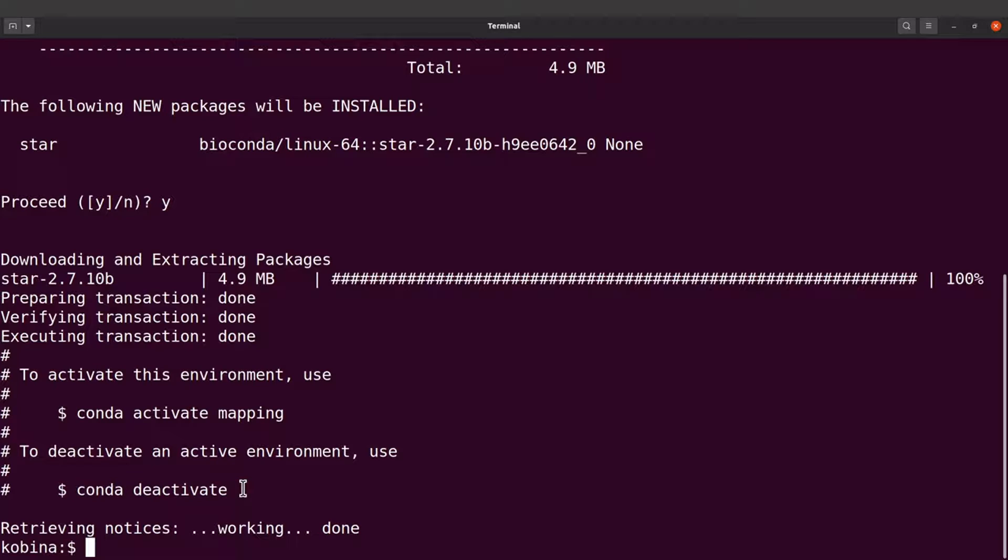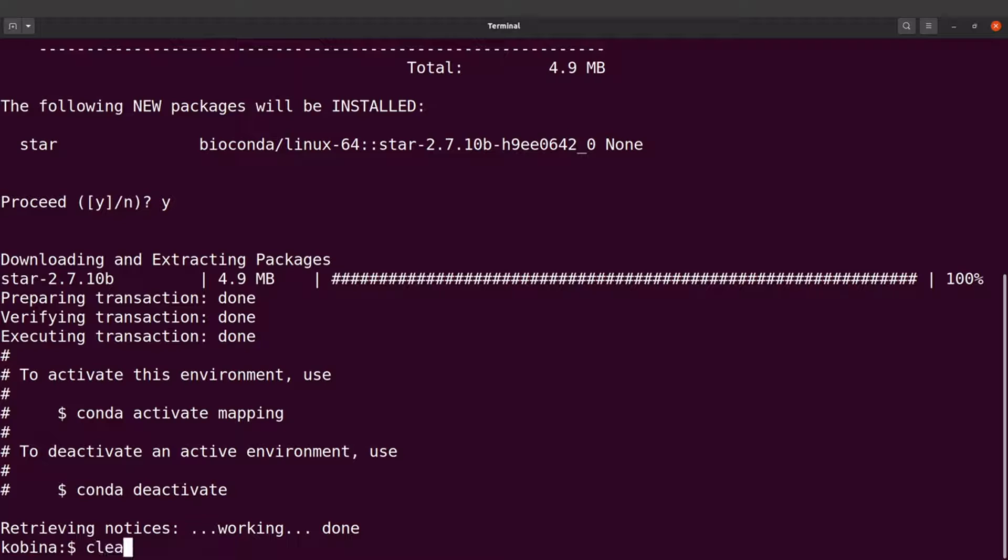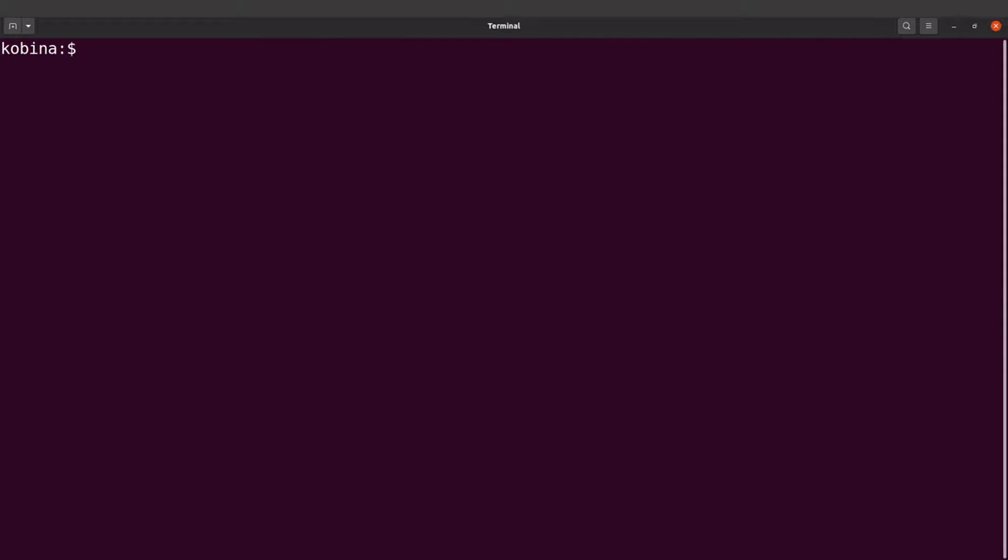So we are going to test STAR. So let's clear the screen and then continue. Okay, now we are going to test STAR.